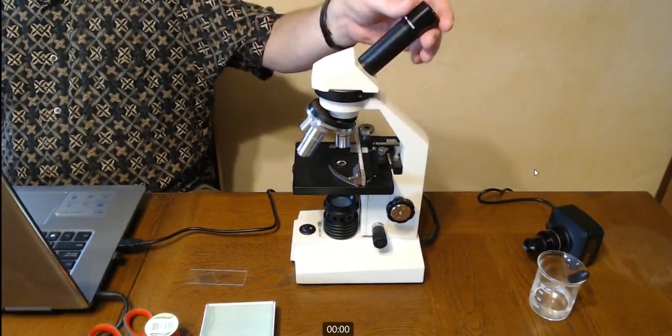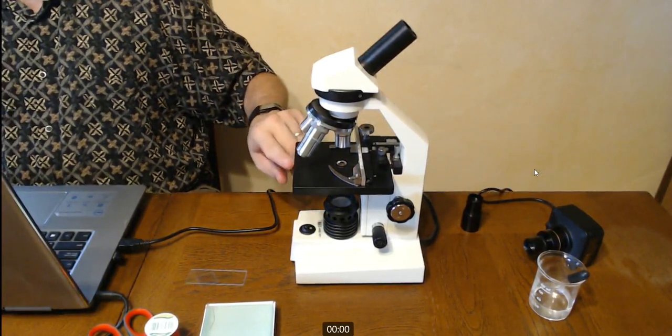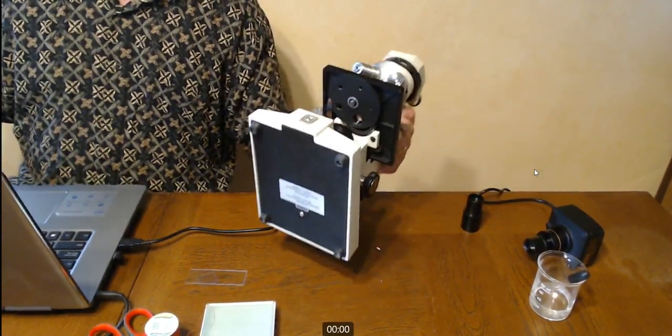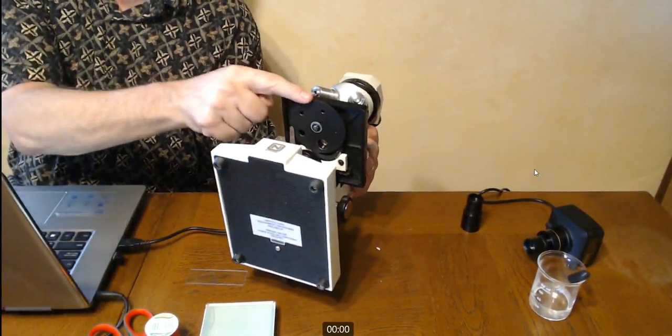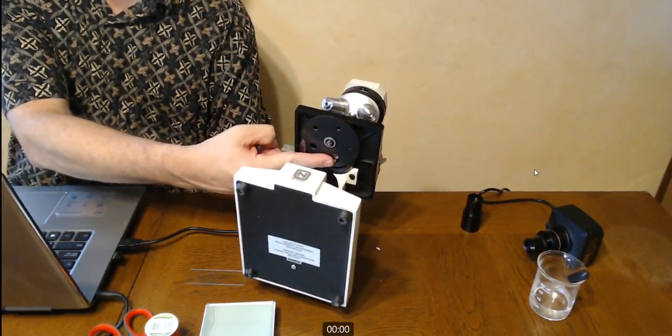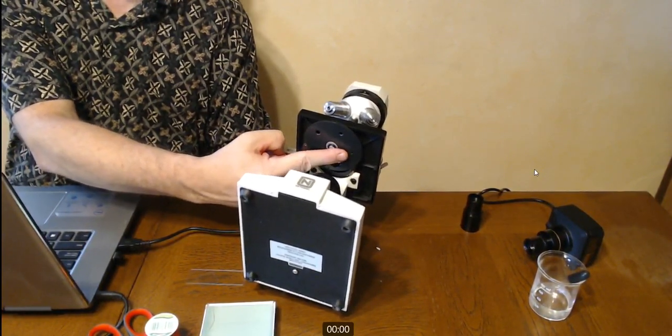Underneath in the front is the diaphragm. It's a little knob. I took that out because I'm going to lift this up and show you the bottom of the microscope. So this wheel here is the diaphragm and all these holes. The larger the hole, the more light it lets through. The smaller the hole, the less light it lets through.